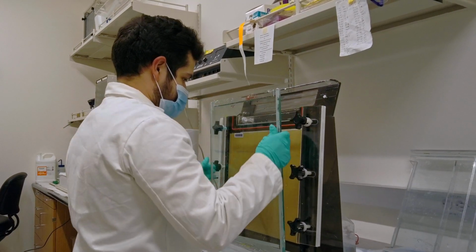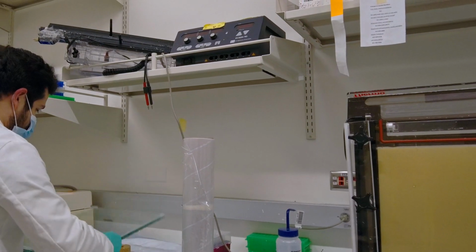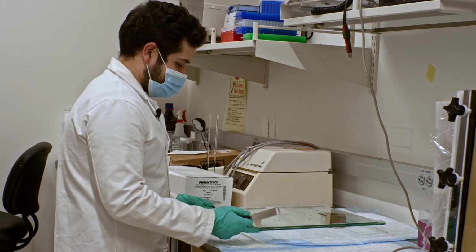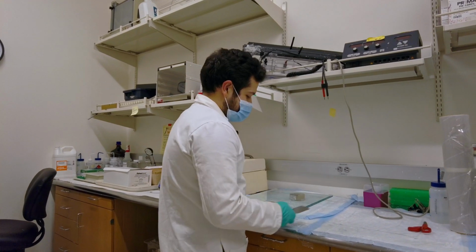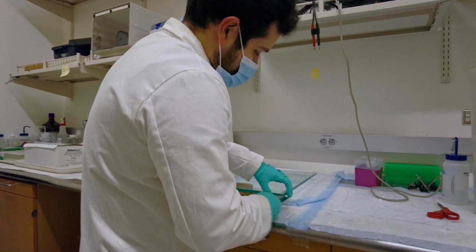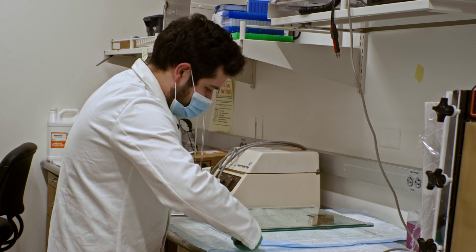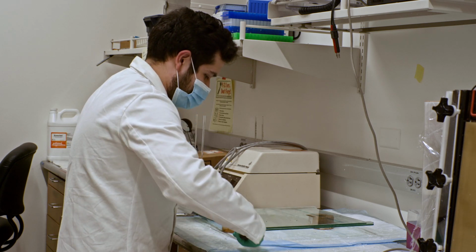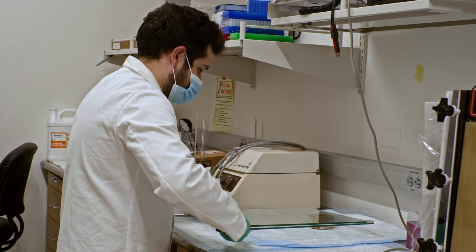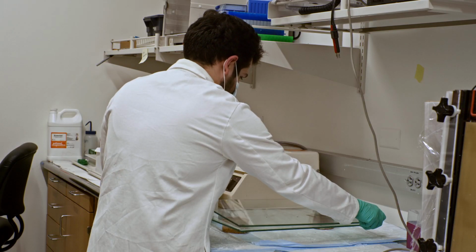Now we're going to move over here to where I originally had these two round bottle flask holders. Now we're going to pop the gel open. So the best way to do this is to basically use a scraper and try to fit it in between the glass plates. This can get somewhat tricky. It's a lot better to do this quick whenever the gel's hot in order to get better separation. But as you do it, and if you siliconize your top plate correctly, you should see good separation of the top plate from the bottom. Should be able to either pick it up, pop the gel off.